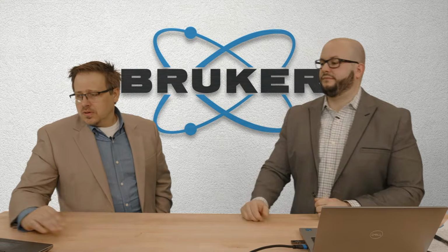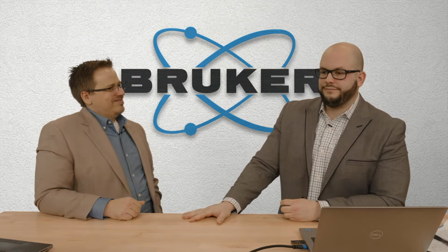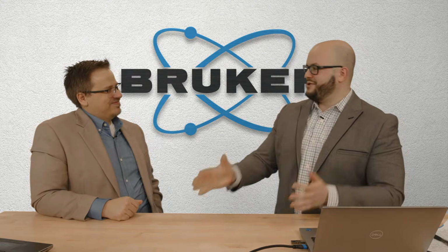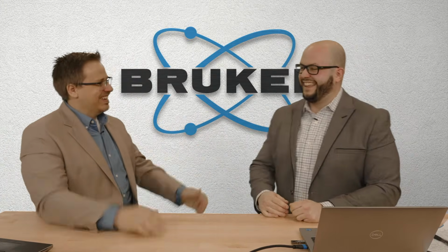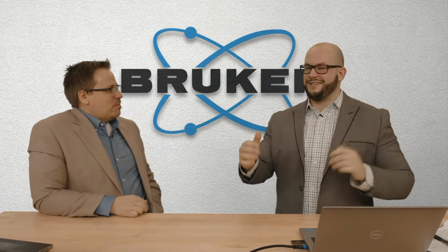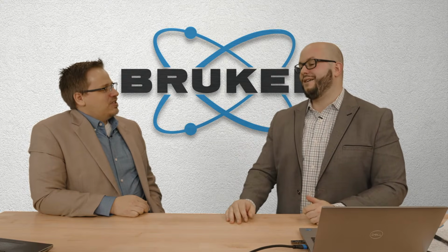From Roger, we have, what is the largest sample that can be measured? Take your engine block out of your car. I got a V8 from my Mustang. Throw it right onto your measurement stage. Tilt it. It's no problem. What is the largest?